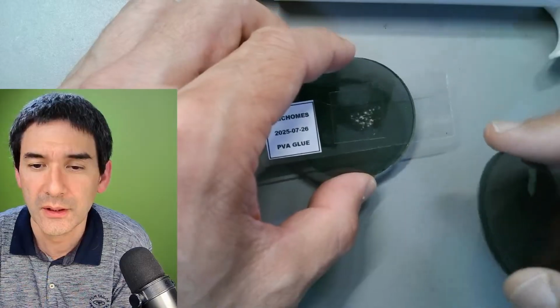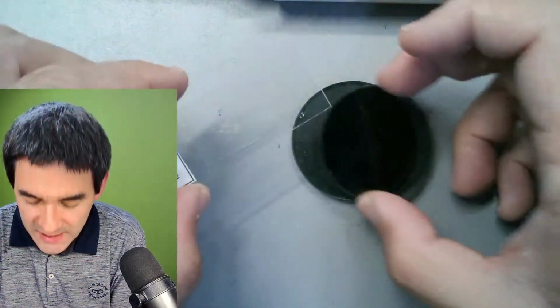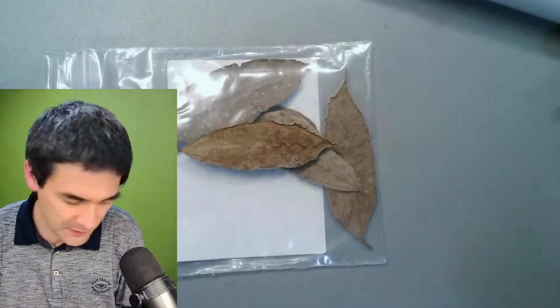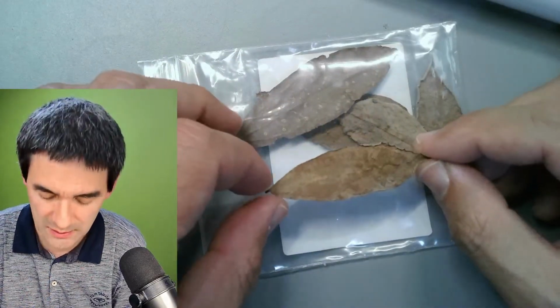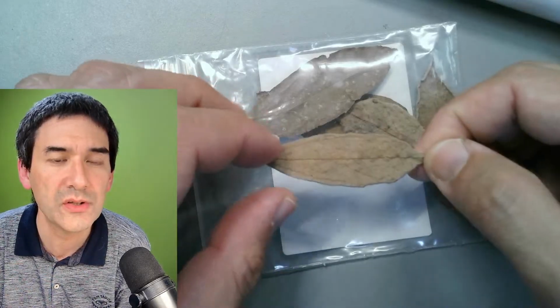Can we see the plant where the plant creates these trichomes? Yes, I'm going to show you the leaf again. Over here it is. Unfortunately, I don't know the name of the plant. Microscopy enthusiasts sent them to me. Right now they're dry. He said this plant was growing in his garden.